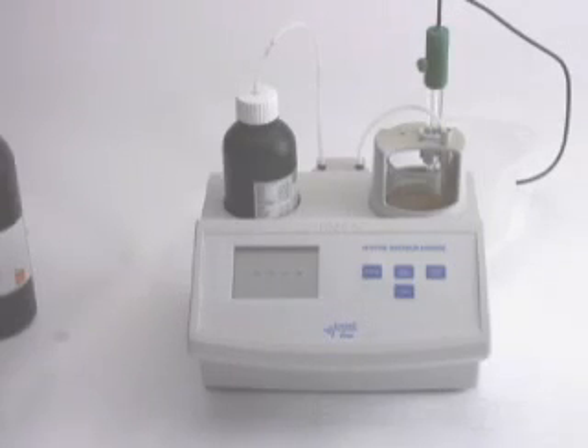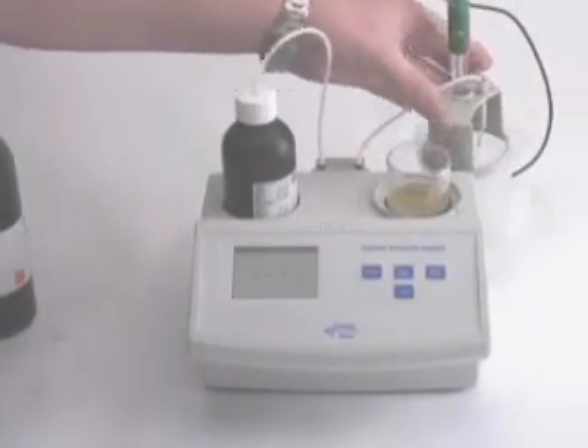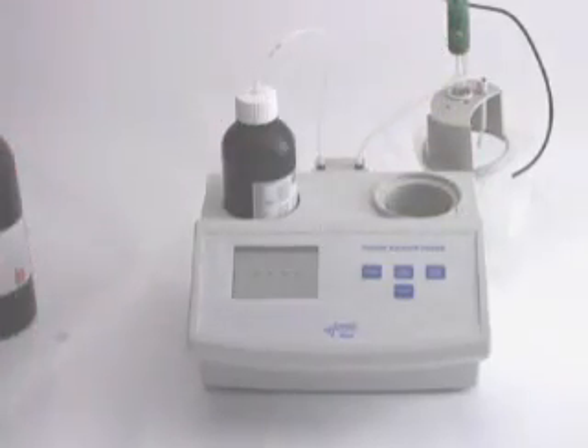Once we're done with calibration, you're going to hear the beep. Your sample should have a light yellow color to it — that means it's finished its titration. Make sure, as always, to rinse your probe in between tests.